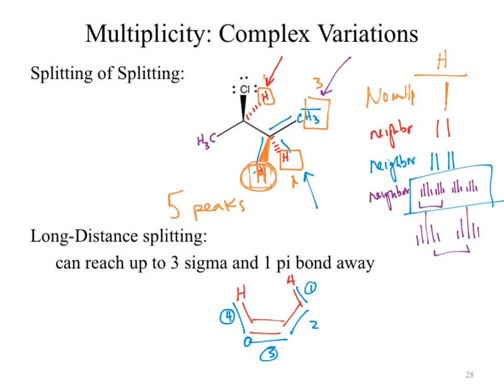If you look at the peaks in the aromatic range, you'll see that instead of just being a nice single sharp peak, or even 2 peaks that resolve all the way to the baseline, you see kind of a fork up at the top. That's due to the splitting of splitting, because the magnet that we used to run that sample was really strong.